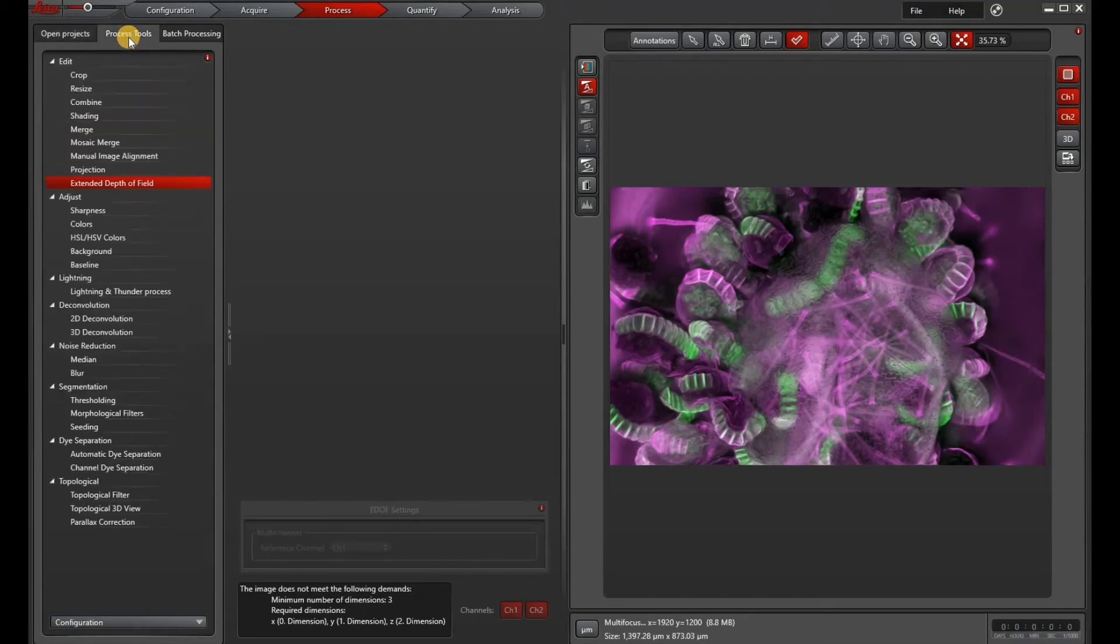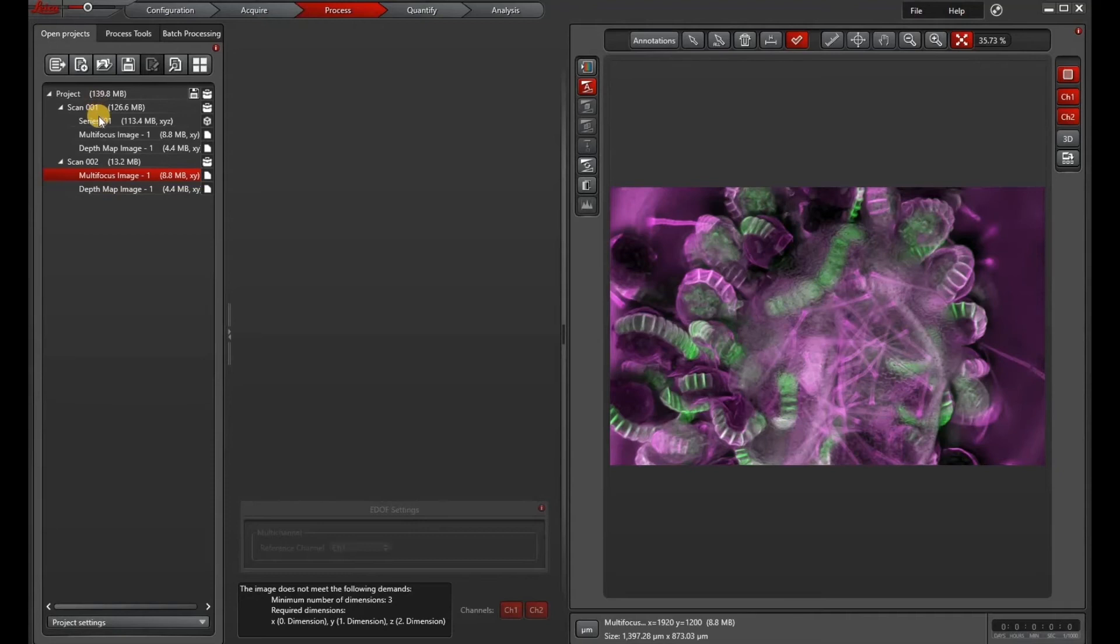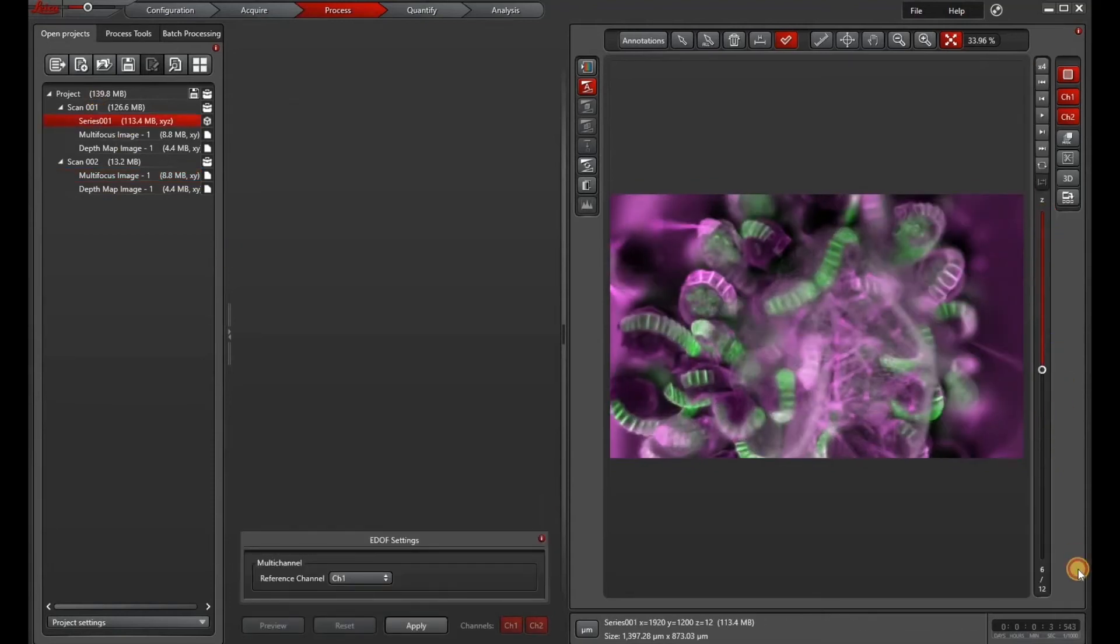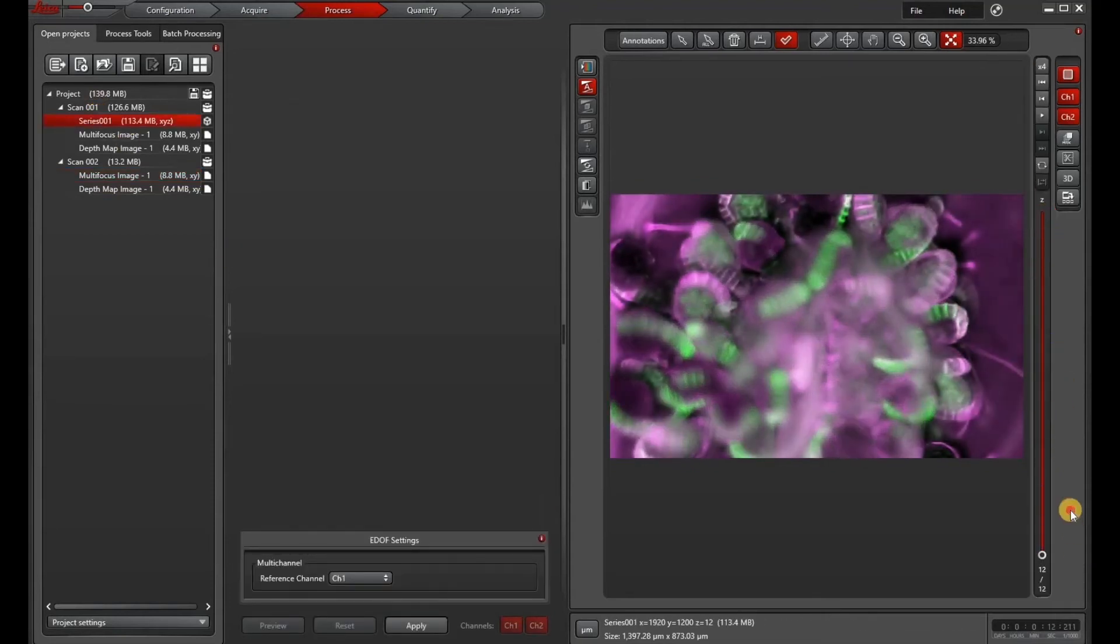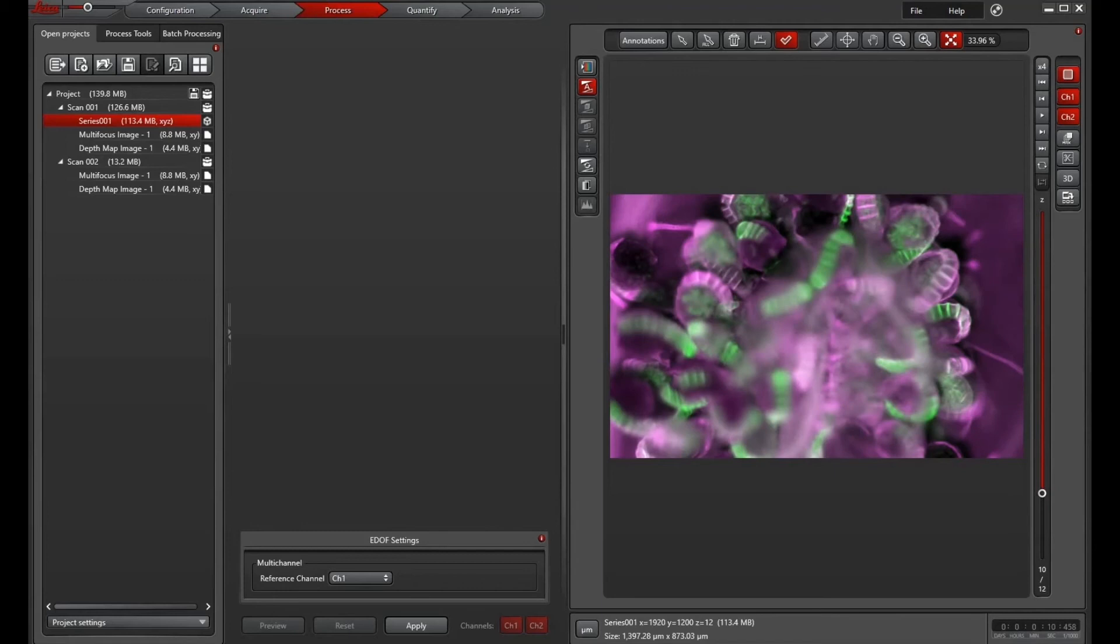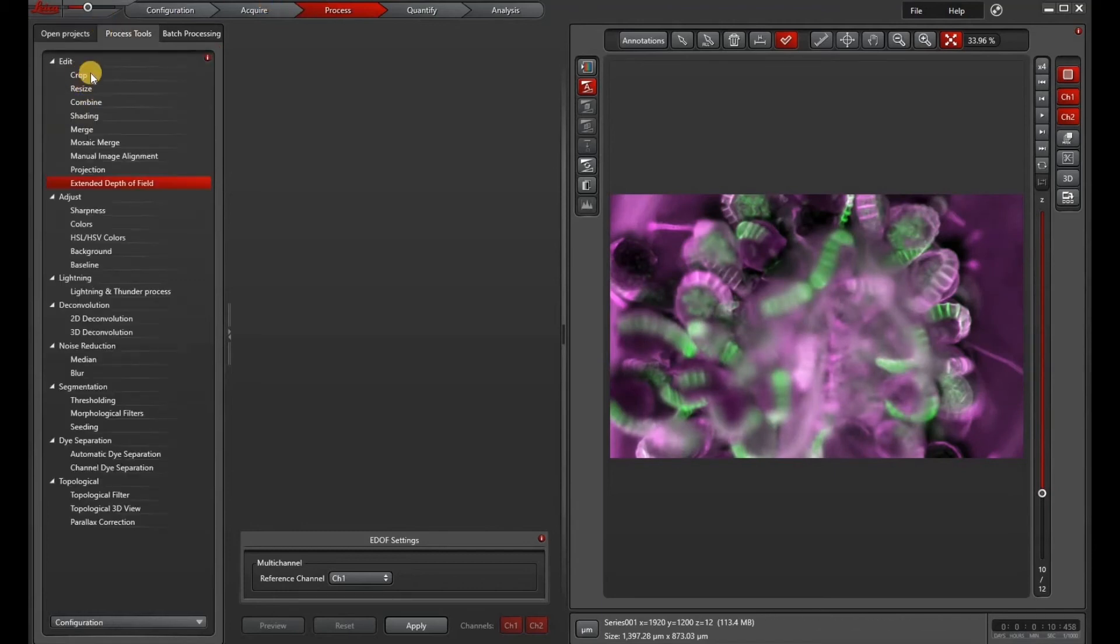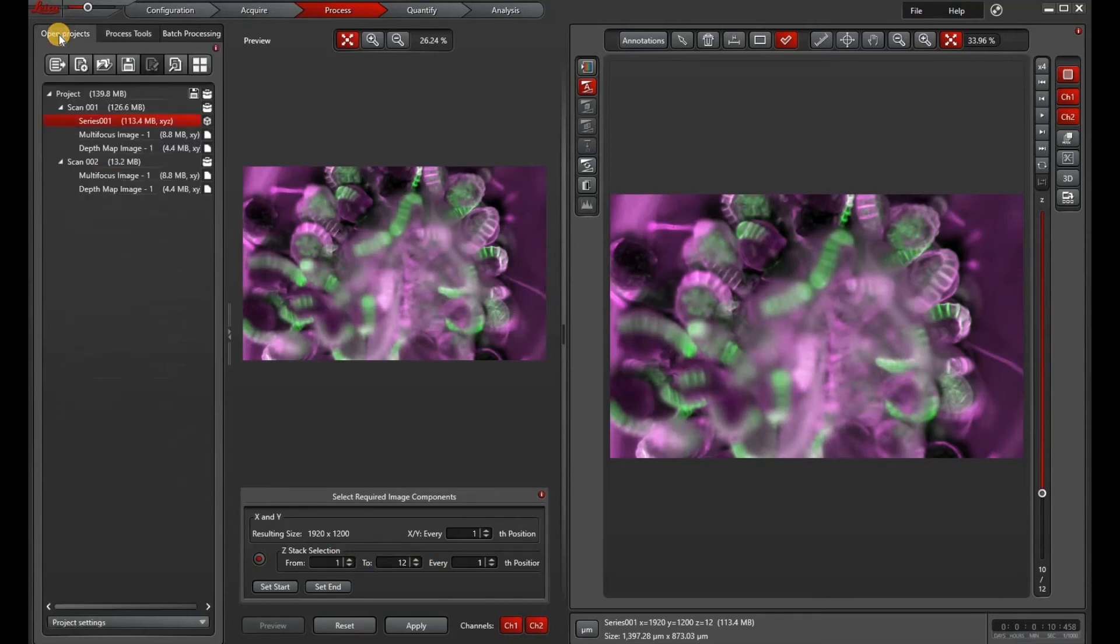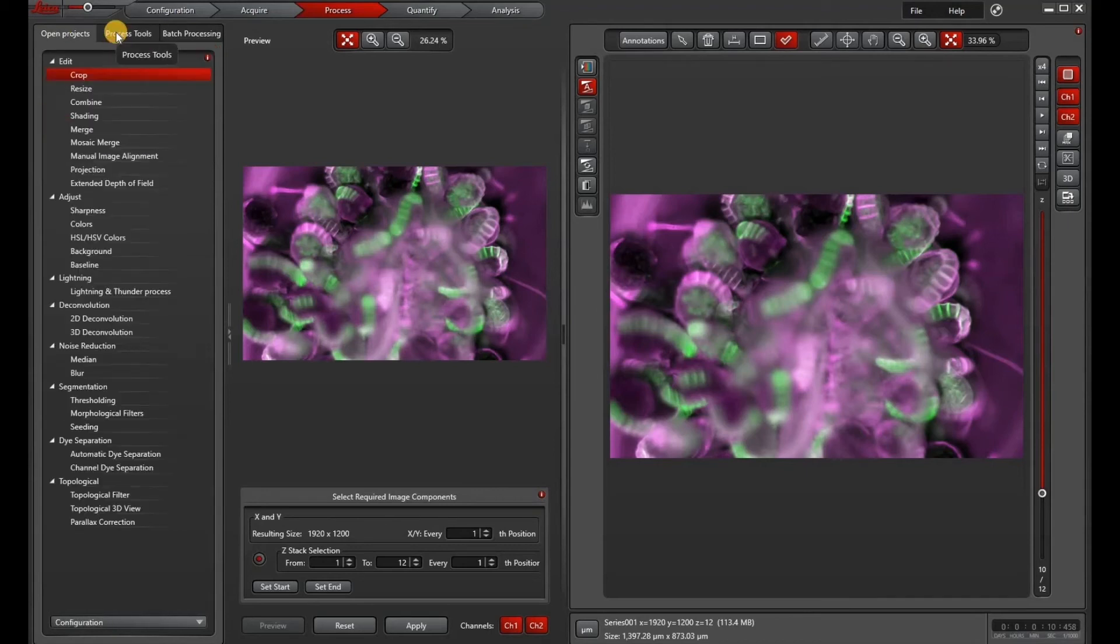So if your EDOF doesn't look good, there's a couple of things you can do. One is to change that reference channel that I showed you earlier. The other is to go into your crop tool and basically edit out the really unfocused images. The way that EDOF works is by contrast. So if it looks really hazy, it won't be able to do a good job of making an extended depth of field.